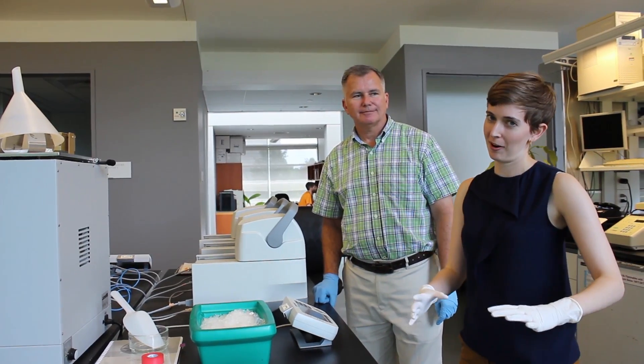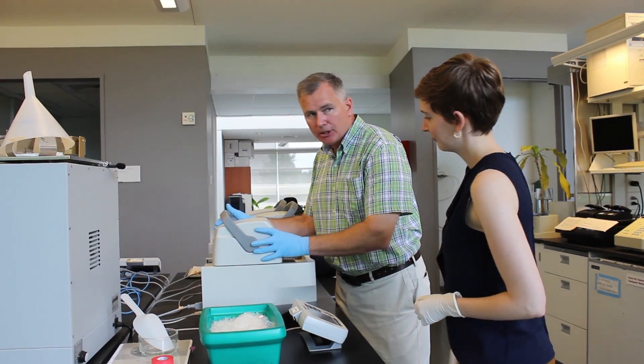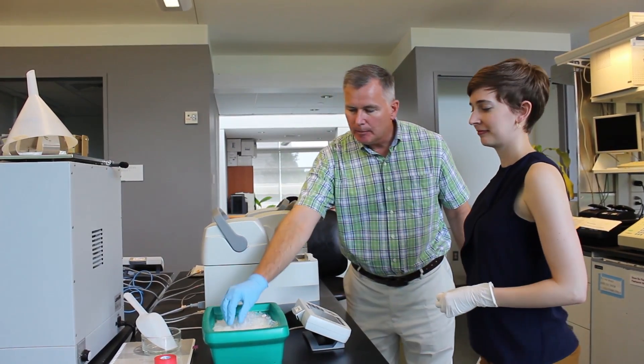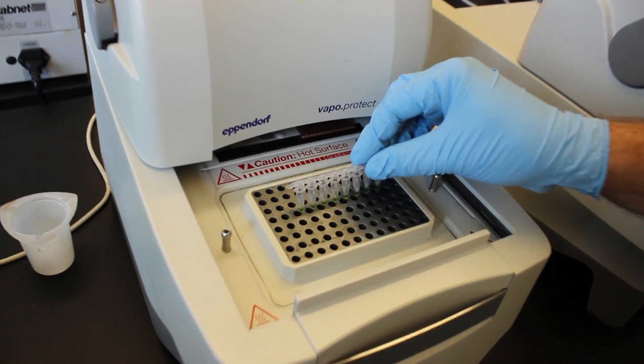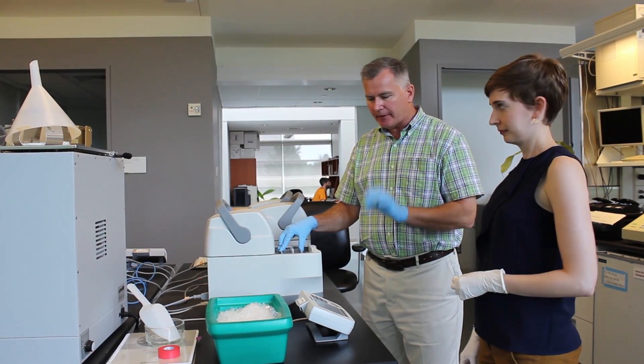Now we're ready to actually run the PCR reaction and we'll be using a thermocycler to do that. And it's really just a precision machine that allows us to place the samples into a series of wells and the machine goes from different temperatures very quickly and very precisely.